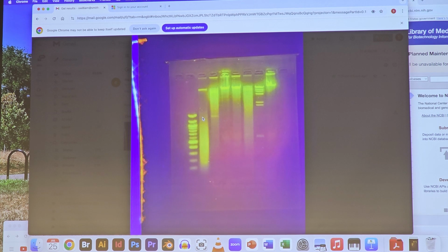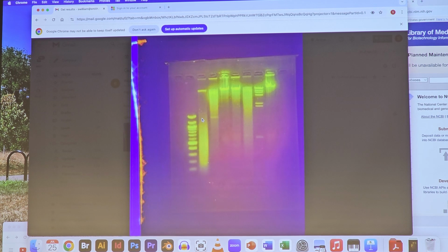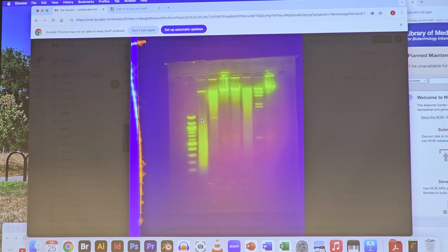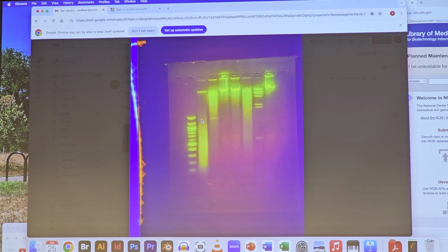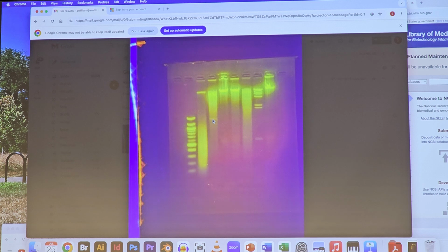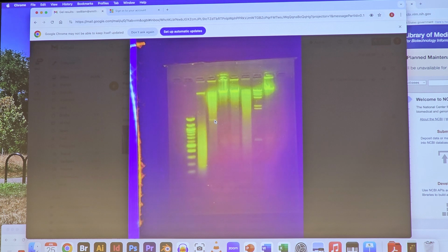And so all those repeats get cut by EcoR1, and you get a lot of these EcoR1 fragments that are exactly the same size from this repeat that's scattered all over the genome. And so you actually see a band in the EcoR1 lane, and that's from that LINE1 repeat. Well, how can I be so sure? We actually used to work on this LINE1 repeat in class, so I know for sure that's what it is.